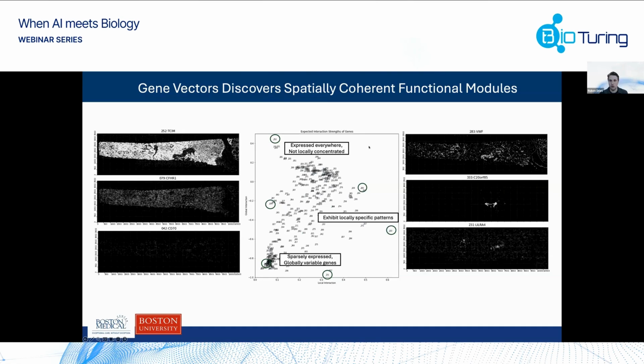Yeah. So that's the whole plan, that you can overlap and generate the count matrix and do anything downstream. You can also see which transcripts, for example, do not overlap, and that's sometimes interesting: which transcripts do not have a cell. They're floating around, and is that because there is no cell segmentation, or is that because of another reason?